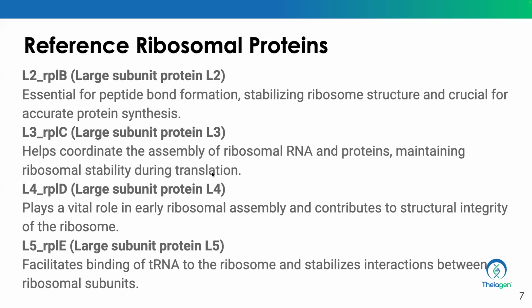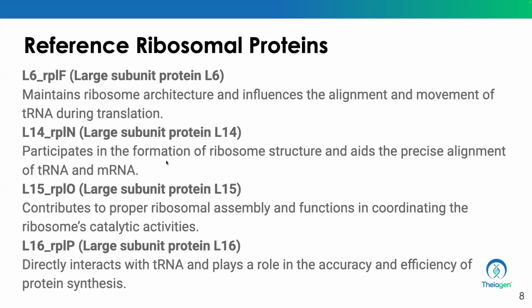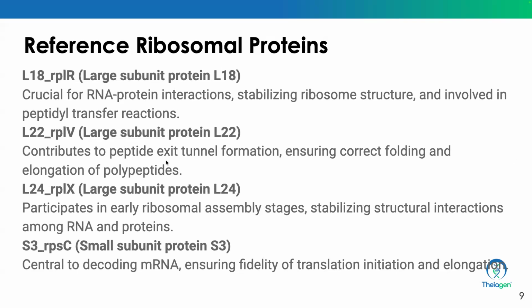So it's a long list with different functions. I'm not going to dwell on what each does, but as part of the slides, I have a description of what each protein subunit is. You can look into those a bit later, together with the paper that I just sent.